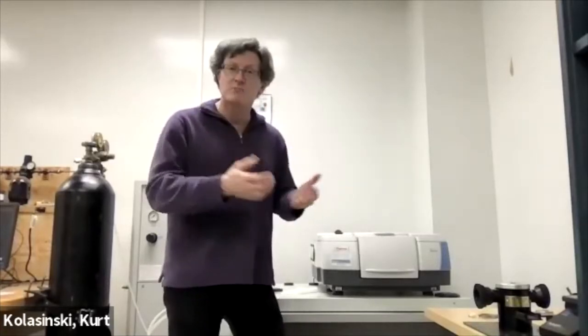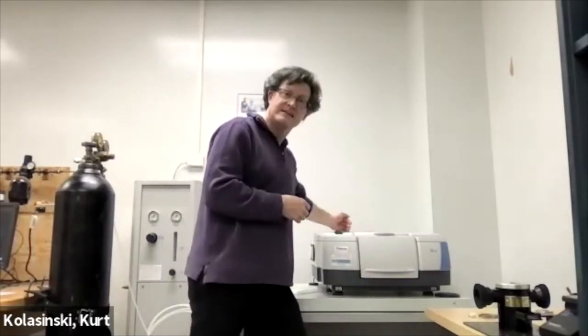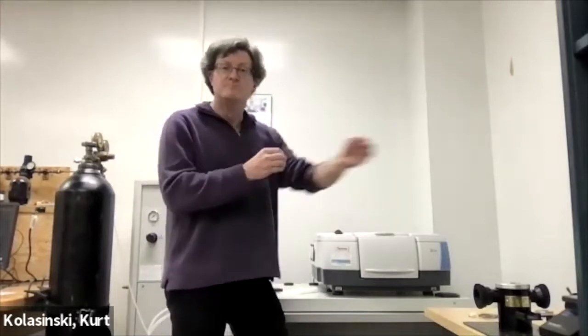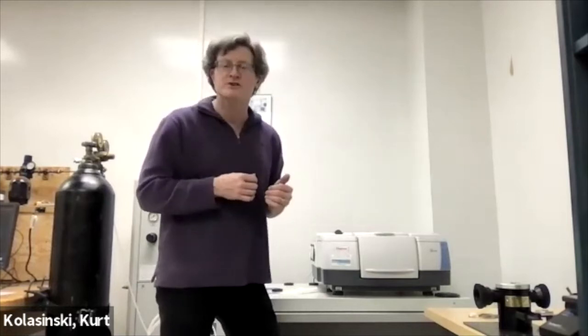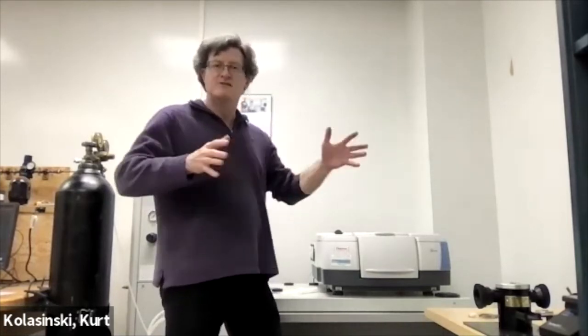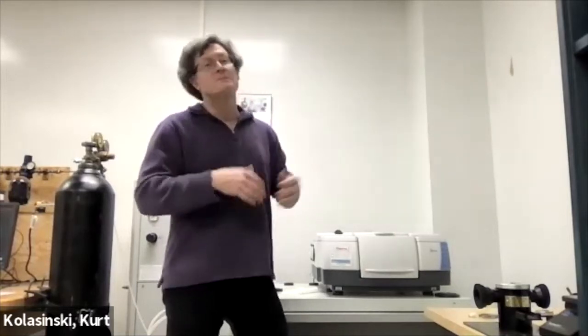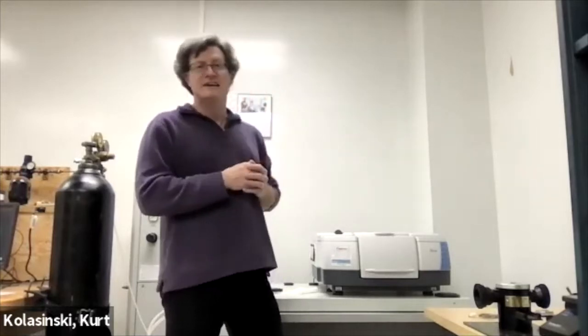Okay, now how are we going to interpret this? How do we get our pattern? Actually, what's important is in that interferometer, there's a mirror on a sled, and it's movable. And if it moves farther, you get more resolution, right? You get more elements in your Fourier transform, and you get more resolution. But if you have to move it farther, it takes longer, right? For higher resolution, it's going to take longer.